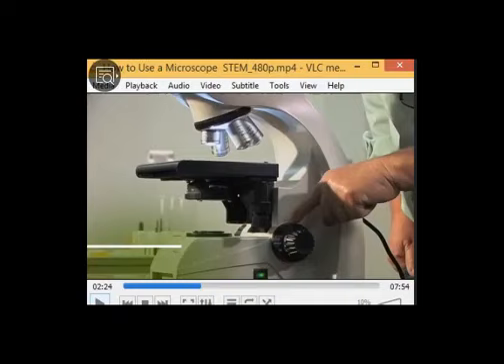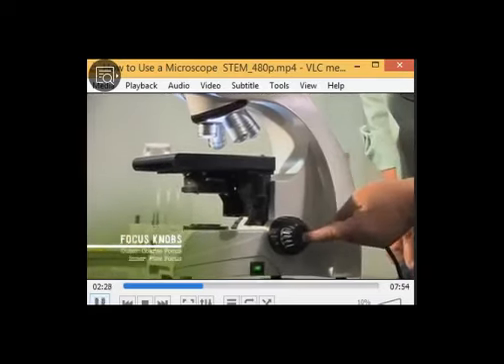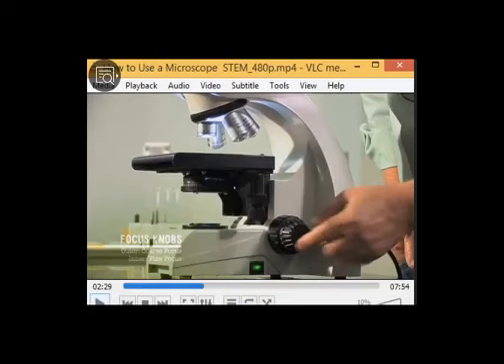When you move this knob, the stage will move up and down fast. When you move the small button, the fine focusing knob, the stage will move slowly. Sometimes we use the fine focusing knob, sometimes we use the coarse focusing knob.